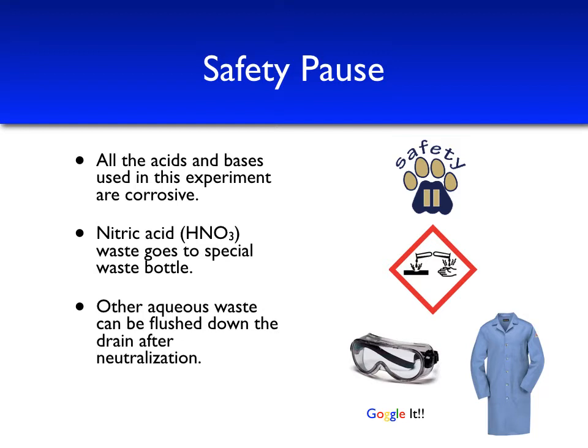For waste disposal, we note that nitric acid, as an oxidizing acid, needs to be disposed of in a special waste bottle. All other aqueous waste can be flushed down the drain after neutralization with plenty of running water. And as always, we want to remember to goggle it and wear your flame-resistant lab coat.